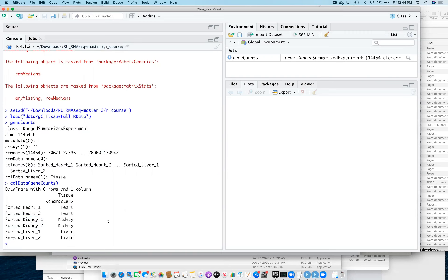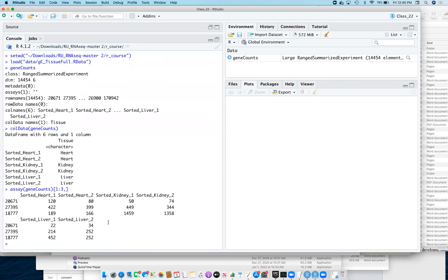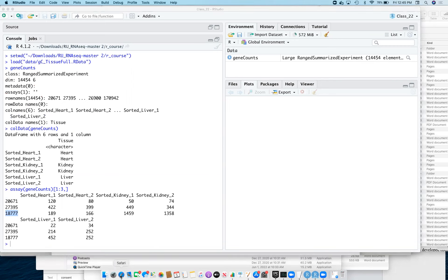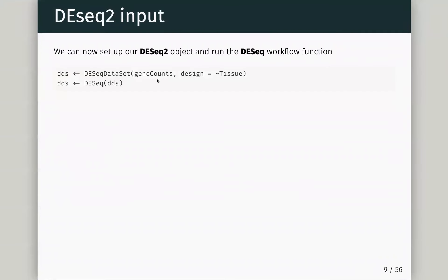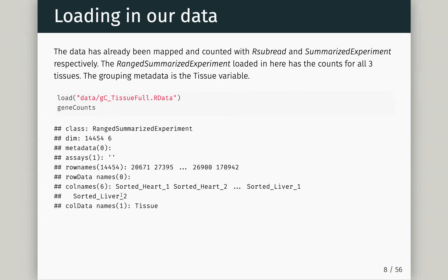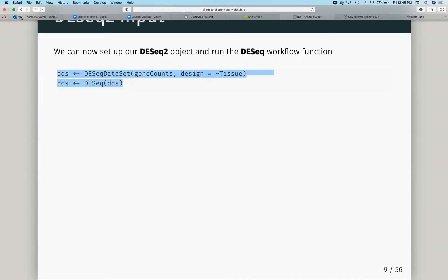So still quite a simple experiment, but now we have three conditions. We can remember if we want to get to the actual matrix within this object — the counts — we can use the assay function and that will give us a matrix. Looking at the first three rows, we have our pre-normalized counts, and we have our Entrez gene IDs. RangedSummarizedExperiment objects are super useful. To start differential analysis on them, we use DESeqDataSet, which will take our RangedSummarizedExperiment object and we just need to tell it what we want to test over — what groups we're interested in — and here I'm going to say tissue.